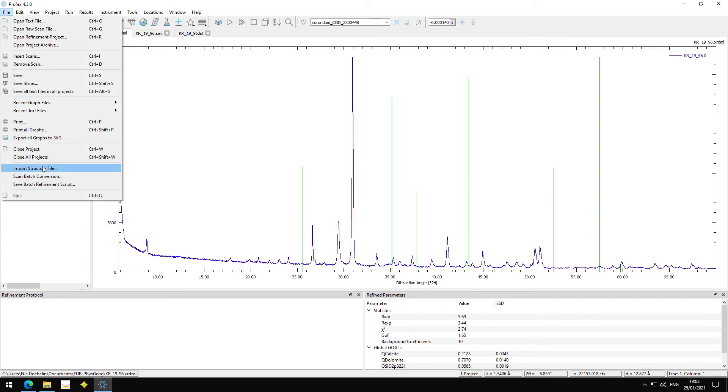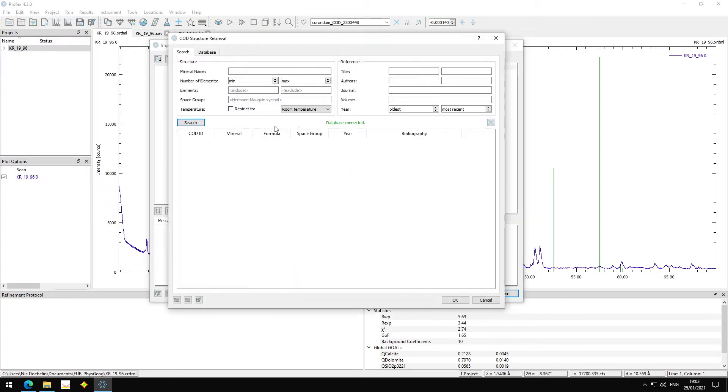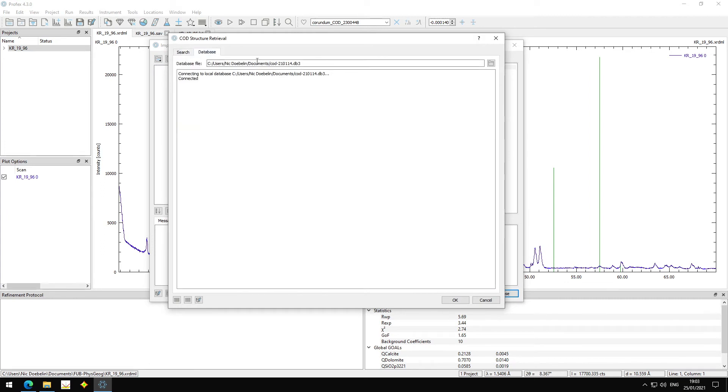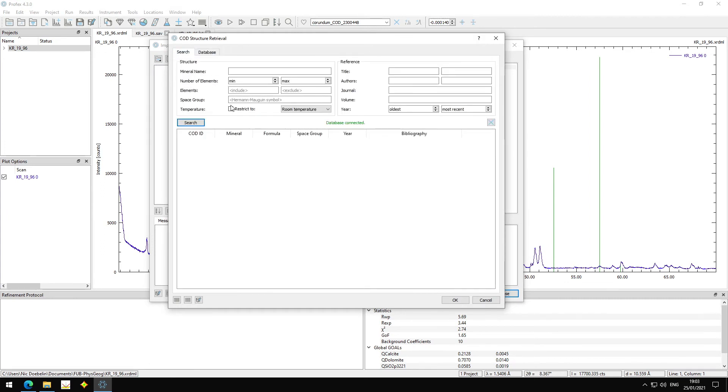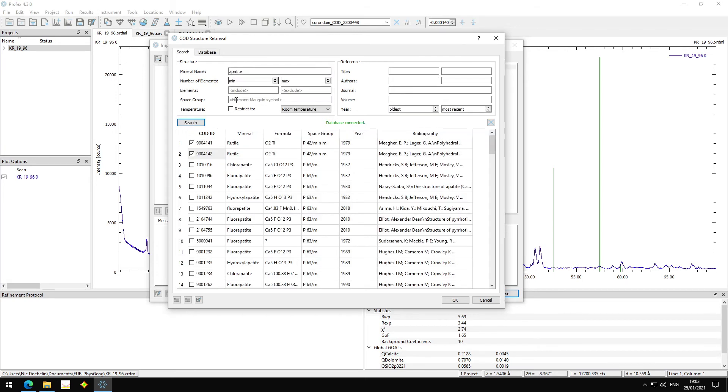So again, we go to Import Structure File. We select Retrieve from Database. When I open it again, it's already connected. It remembers this file. I can search for, let's say, rutile. And let's just pick one or two. Now, if I continue my search for maybe apatite, the ones I checked, the rutiles will remain in this list. So they are still here and still checked.